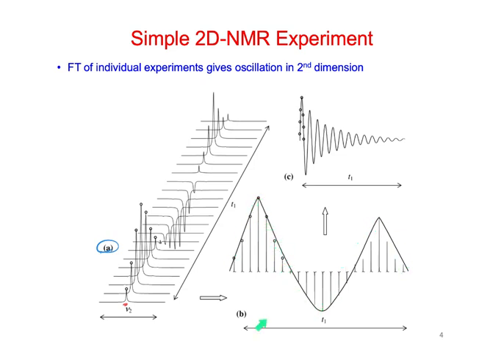And if we extend this out longer in the T1 dimension, we get something that looks like this up here. And it's getting smaller. Why is it getting smaller? Because you're waiting longer. We're waiting longer, and relaxation is going on during this time.